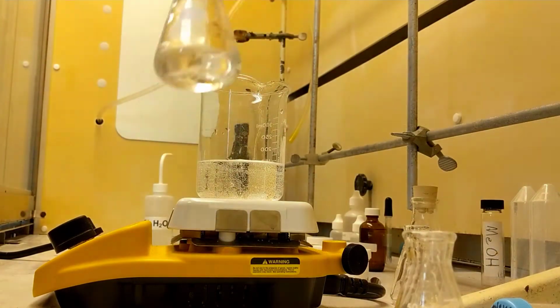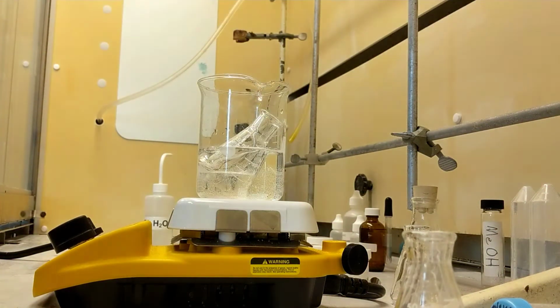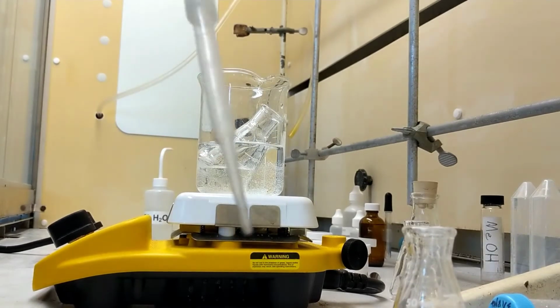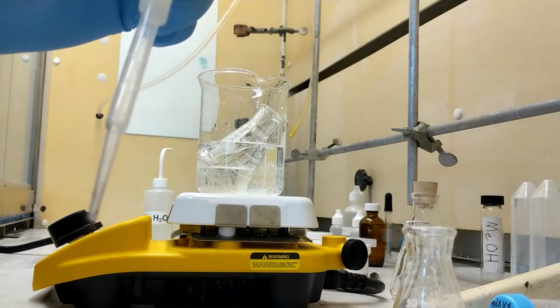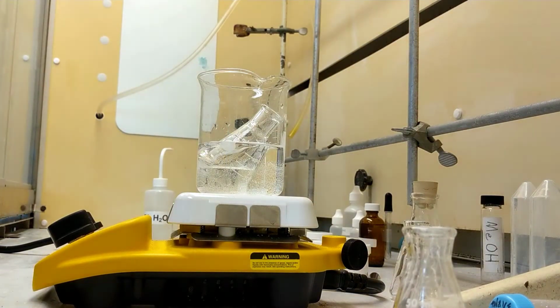Now I'm going to add this flask right here to that beaker that's at about 45 degrees Celsius. I mean, all that water is at about 45 degrees Celsius, and I'm going to run an air tube into it. See if you can hear it. To try to dry it out.